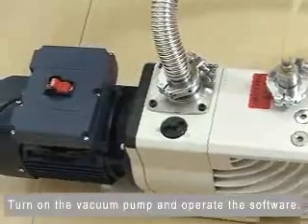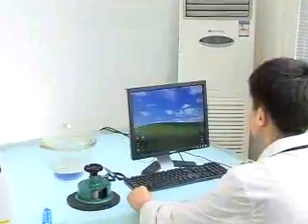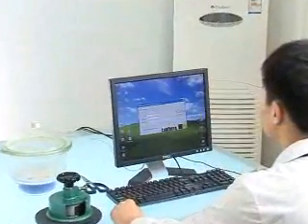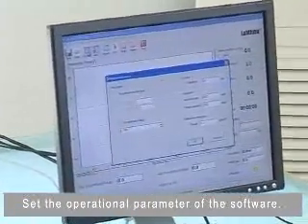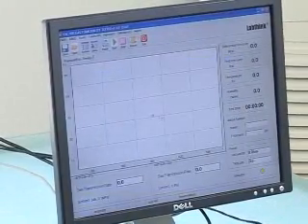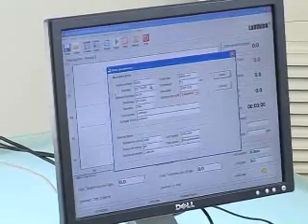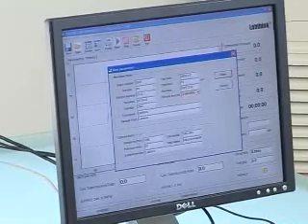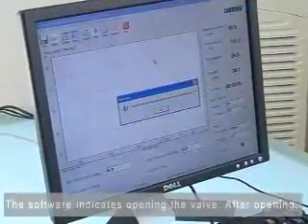Turn on the vacuum pump and open the software. Set the operational parameters in the software. Press the testing button to begin; the system will indicate when to open the valve.